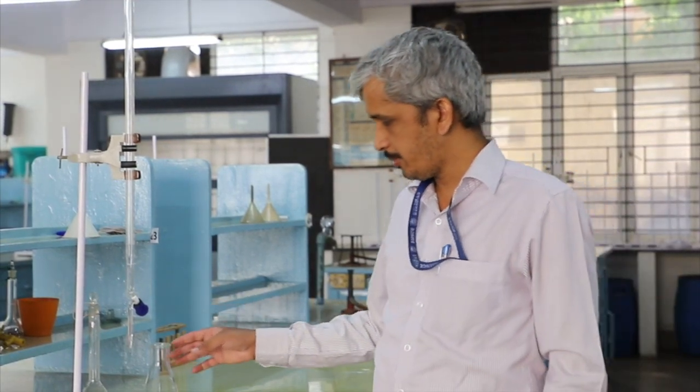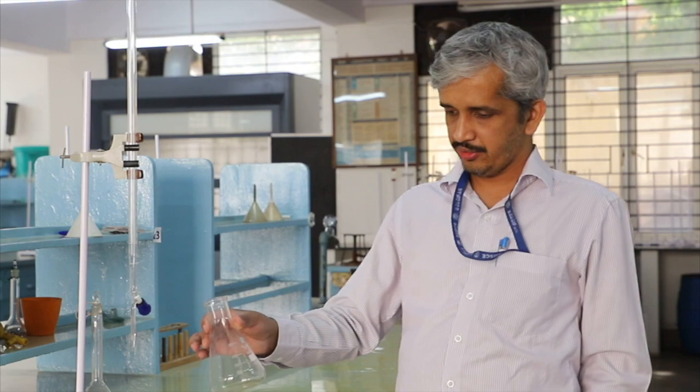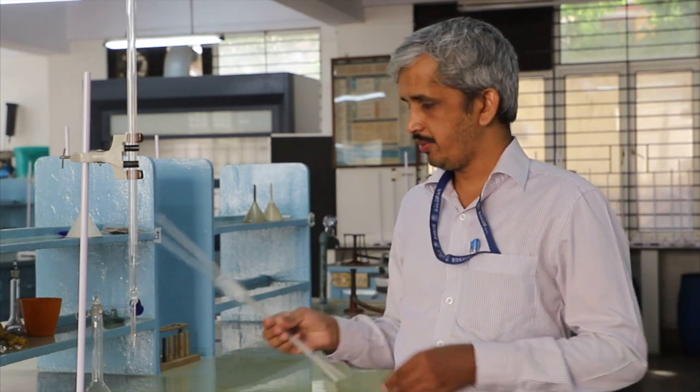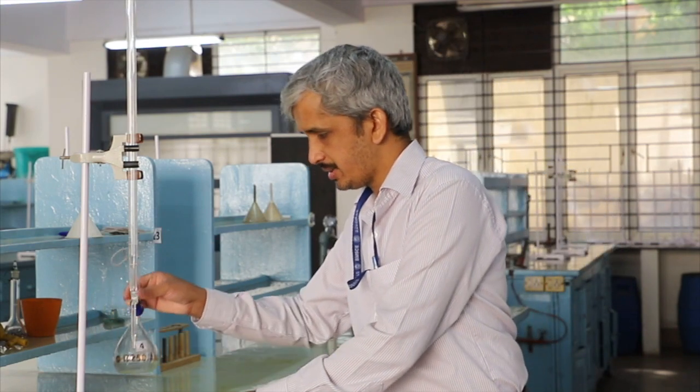So in total we have 4 titrations. These are the common apparatus used in the titration. The first thing, all of you are aware of this. This is a conical flask. Then we have a buret, then pipettes of 2 different sizes. One is 10 ml, the other one is 25 ml. Then we have a standard flask.